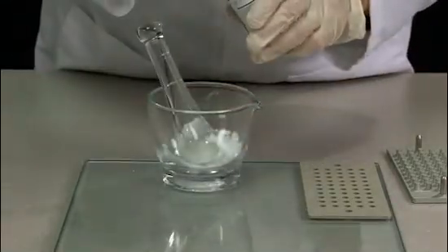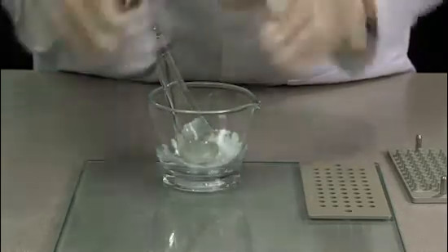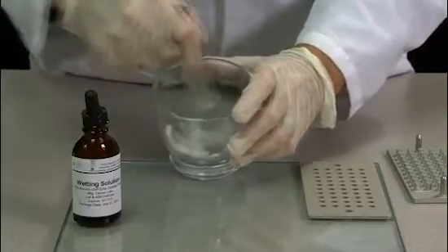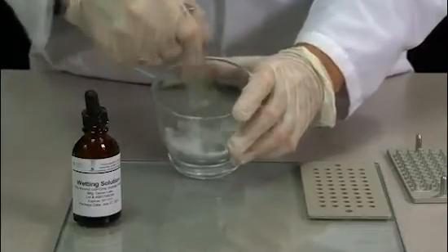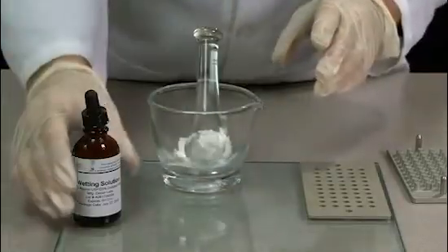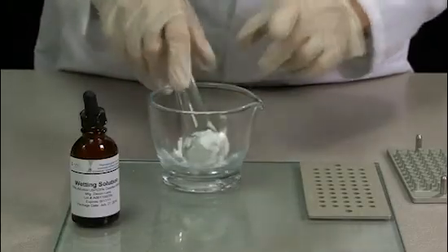You will notice as you continue to add the wetting solution that the powder will become more paste-like. And you can see that some is starting to adhere to the pestle.